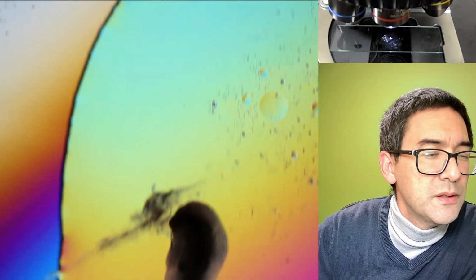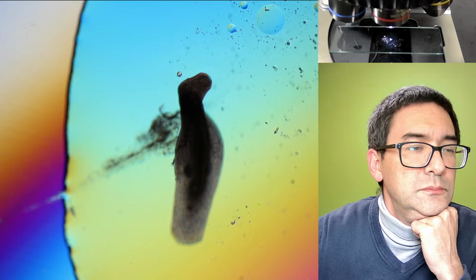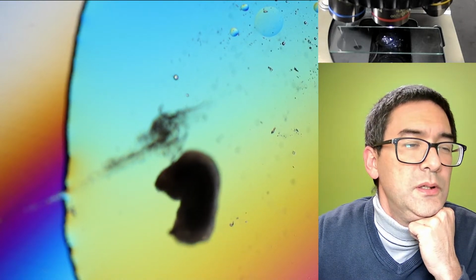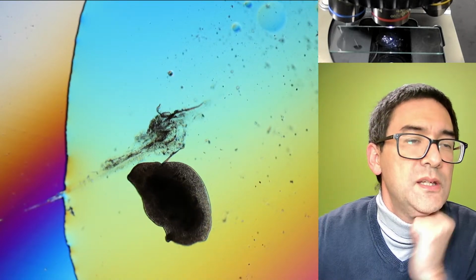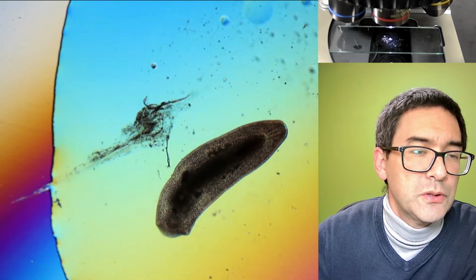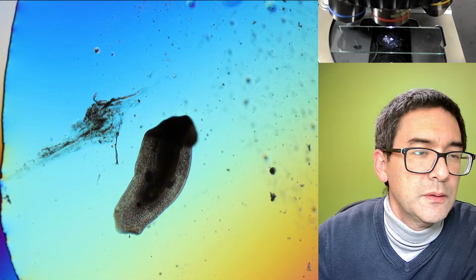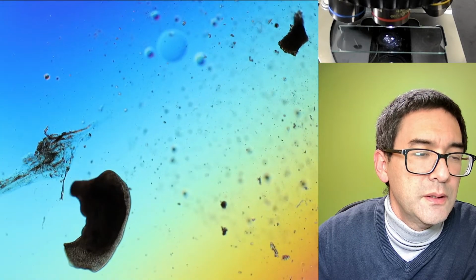Okay, and where is the flatworm? And let's see what it does. It could actually be that it sees some food, a source of food, in those little chip particles, and maybe it will feed on it. Yeah, you see that there.